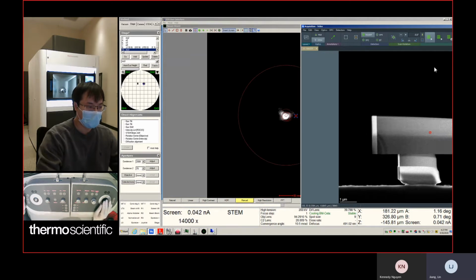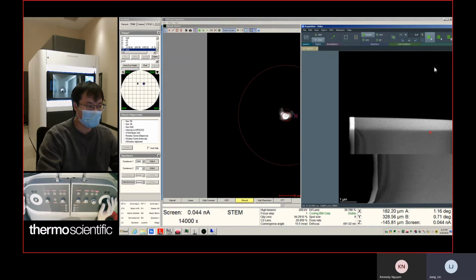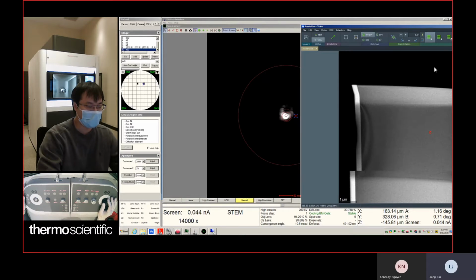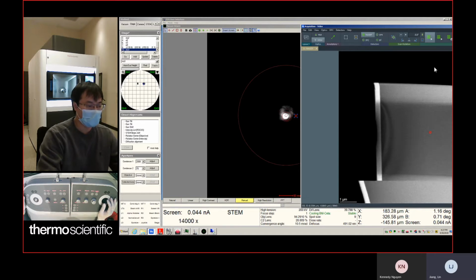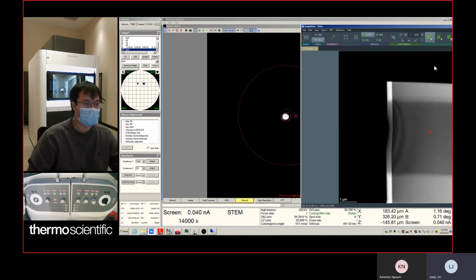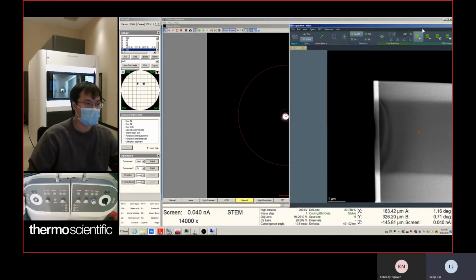So what I'm trying to tell you is, when you look at how far the center of the crossover of your Kikuchi pattern is from the center of the disk, if it's about 20 milliradians, probably you need 2 degrees. If you have judgment, you will get a sense of how much you need to tilt.